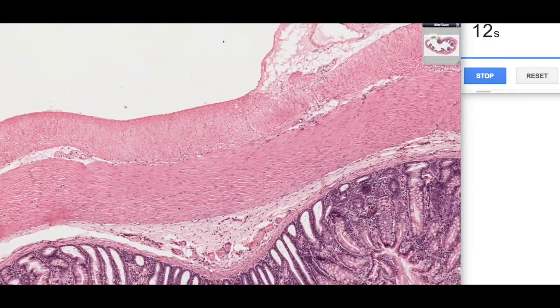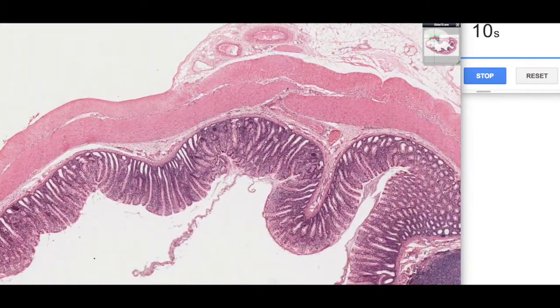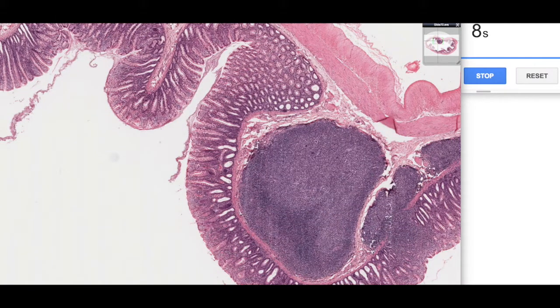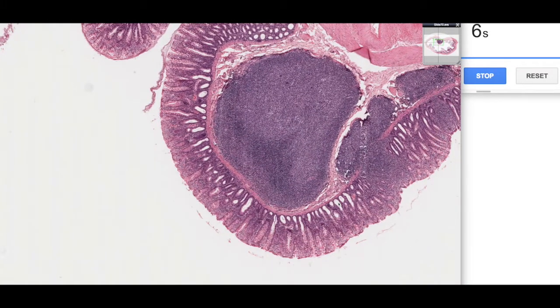So in general terms, we can see just a few other features. These include things like these big large lymphoid follicles, and sometimes you can see them disrupting into the mucosa there. But those are the major features of the large intestine. Thanks for listening.